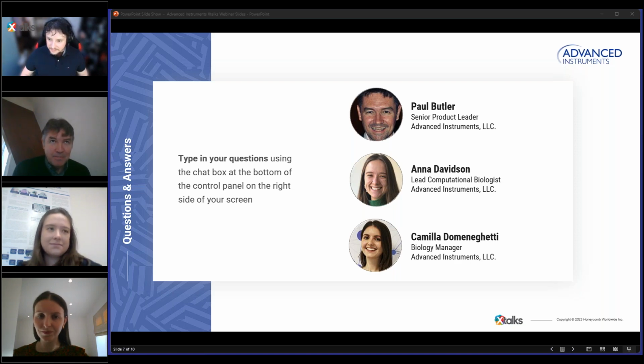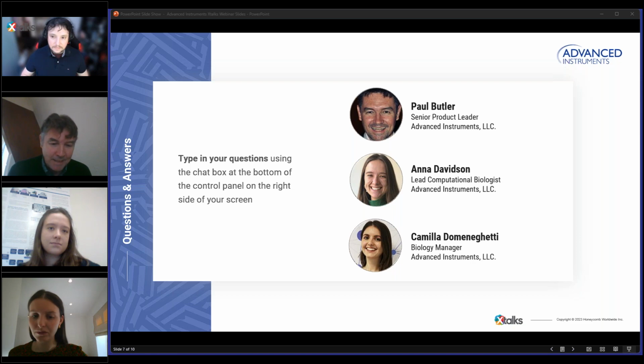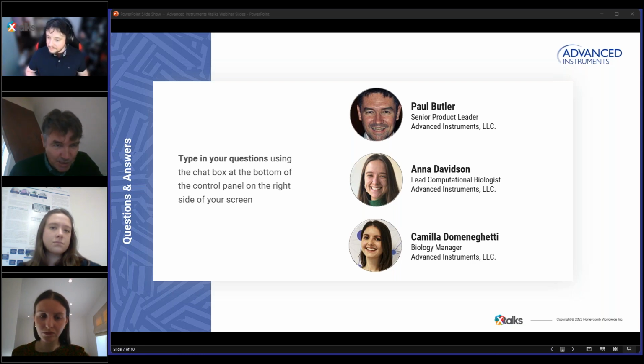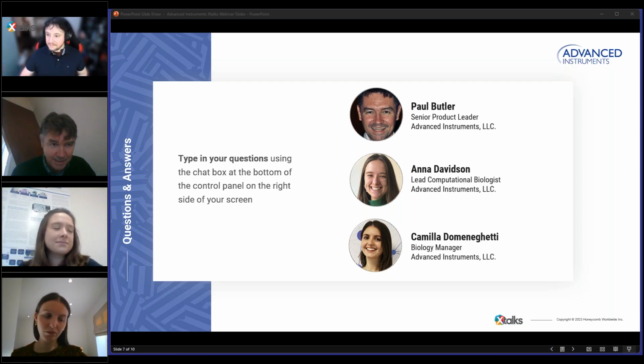The purpose of AEC is to help the end user make the final decision based on their experience. It's there to perform, if you like, the heavy lifting in terms of image analysis. And by that I mean, you saw from Camilla's earlier presentation that typically the user spends somewhere between 2 and 4 minutes analysing images to make a determination of clonality. And I think our polling answers reflected that number quite nicely.